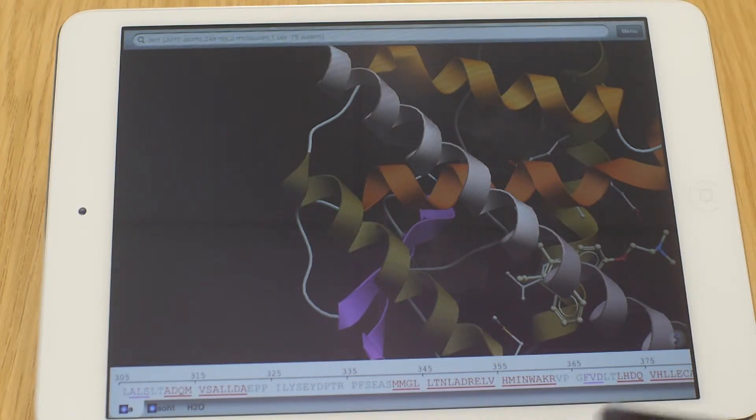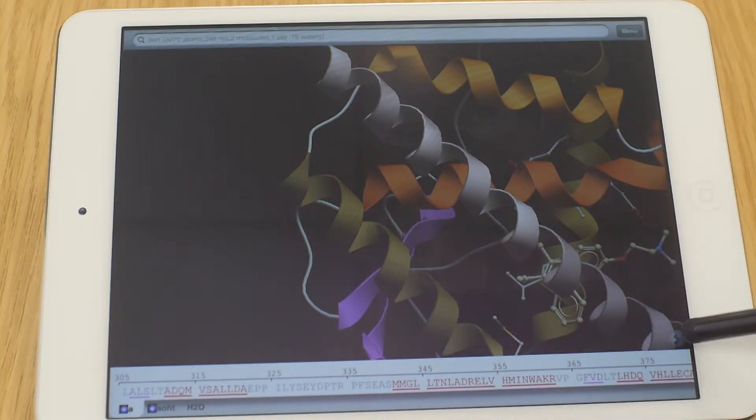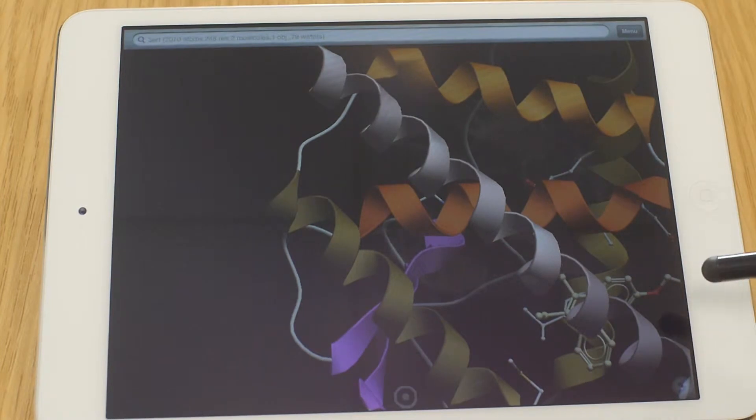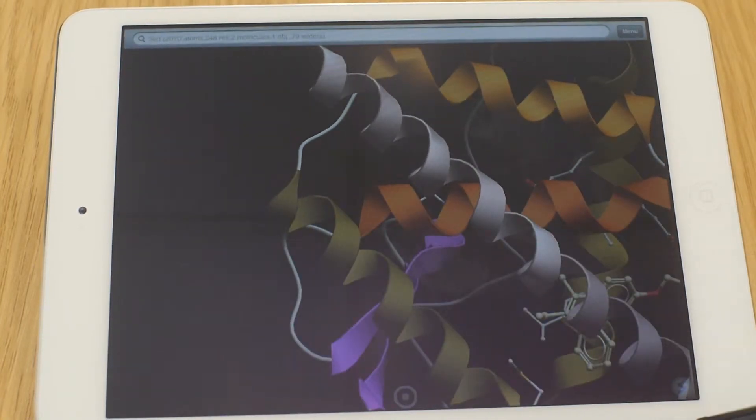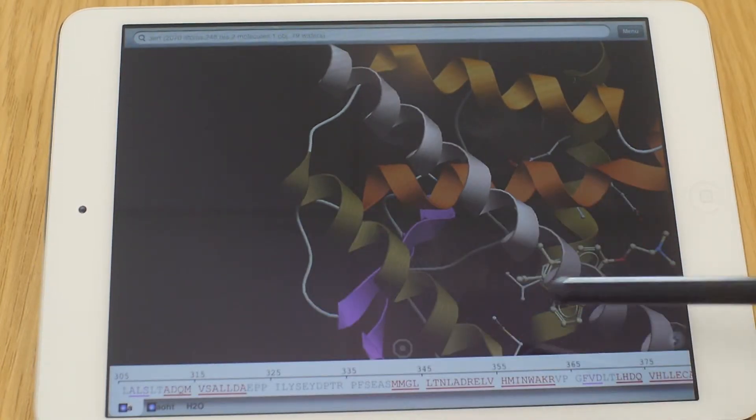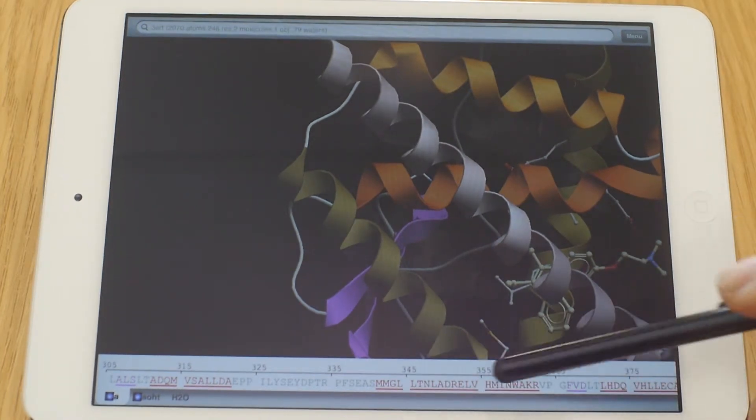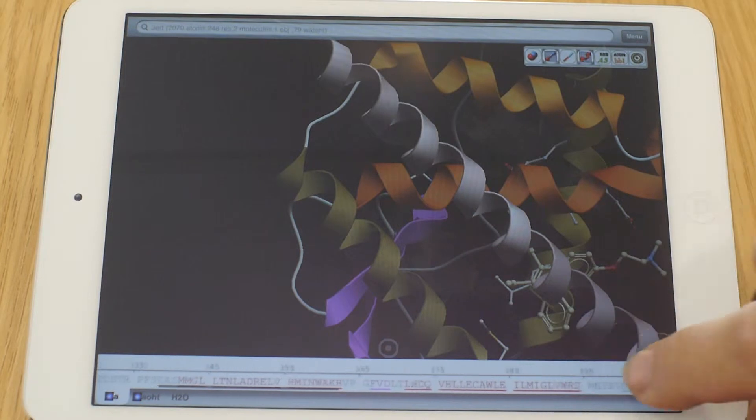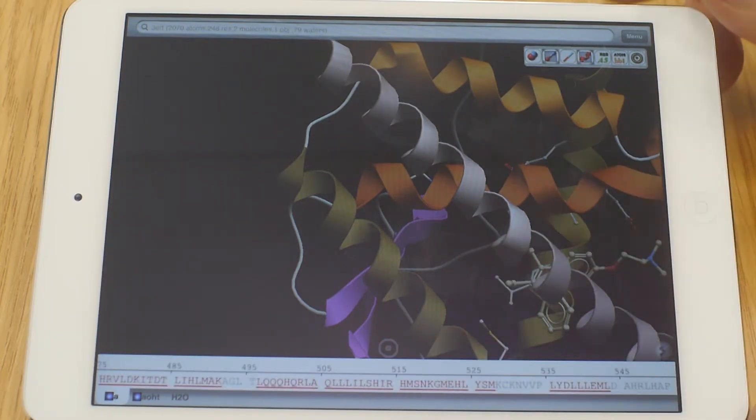Then here at the bottom, we see a long array of sequence. This is because here this button allows us to open or close the sequence view. So we press on this iMoleView button here in the corner. And it opens and closes the sequence view. So the whole sequence of the protein is shown here. You can scroll it along. So you know which residues have actually been used.